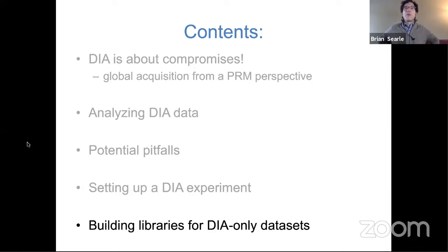That's one of the reasons why we think that the staggering methods are actually a bit better than having lots of different narrower windows. So for example, that 24 m/z wide window that we were talking about, essentially equivalent to your 25 m/z wide window, we can cut that into two 12 m/z wide windows using staggering for free, essentially. And because of that, we get a pretty significant benefit. On faster instruments where we can scan faster, we actually recommend cutting down even further. So for example, on a Lumos, we might use 16 m/z wide windows or 8 m/z wide windows and stagger those so that we can get the equivalent of 4 m/z wide isolation windows after deconvolution.